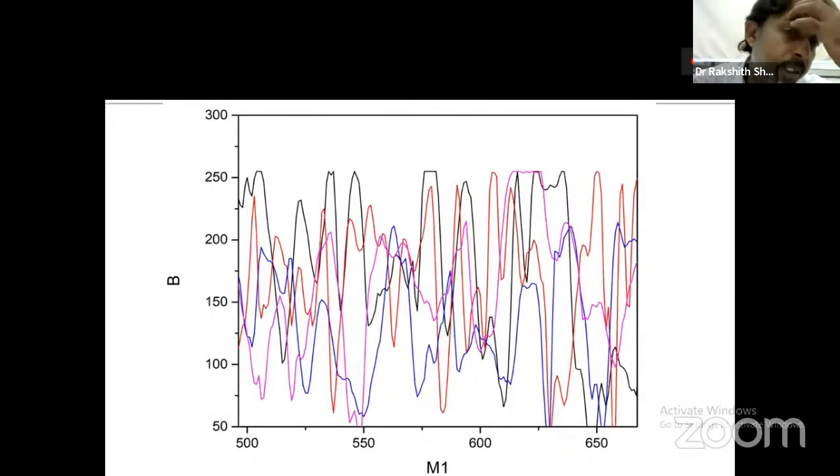Right. So now this is a graphic representation after the image analysis colorimetry. Yes, this image analysis colorimetry, the particular software which is developed is also easily available by this institute, Bose Institute. So if anybody is really interested in some studies, you can join in to do this. So this is the image analysis colorimetry.